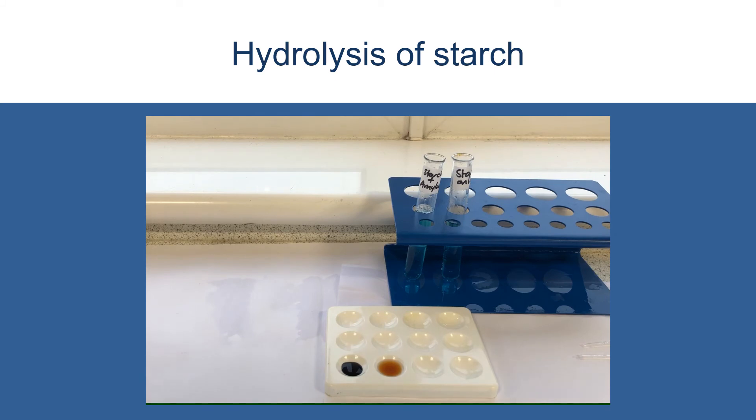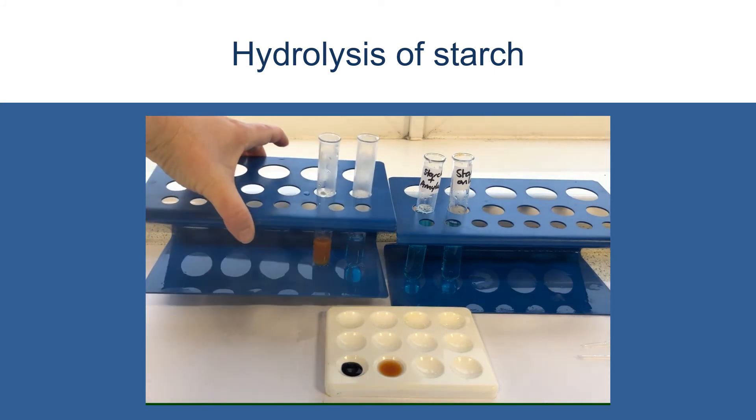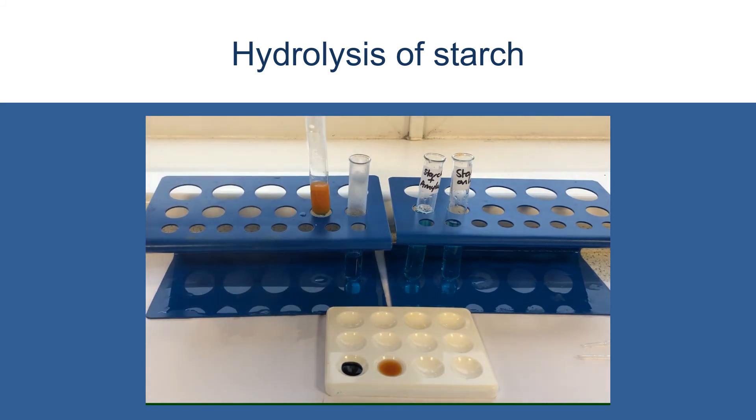When it comes out of the water bath, this was my starch plus amylase and this was my starch on its own. So you can see that we've now got that brick red, brick orange colour. What does this tell you has happened?